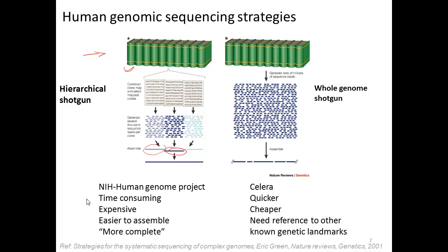This was definitely very time-consuming. It was definitely a more expensive task because of all the labor. However, it was easier to assemble the sequence than at the end because you were only trying to assemble sequence from one volume at a time.